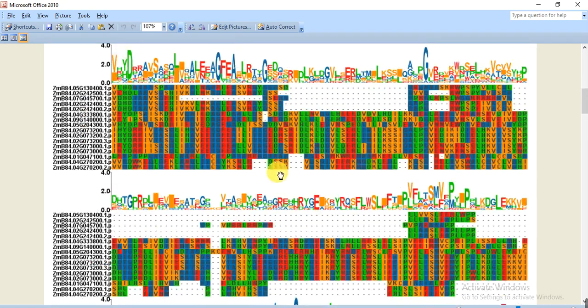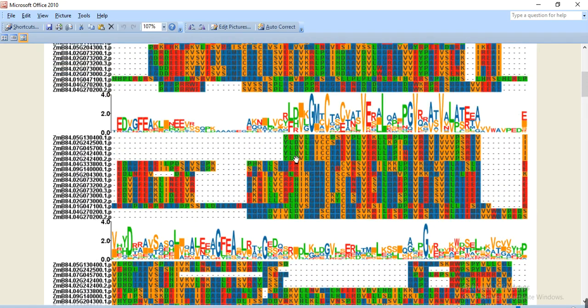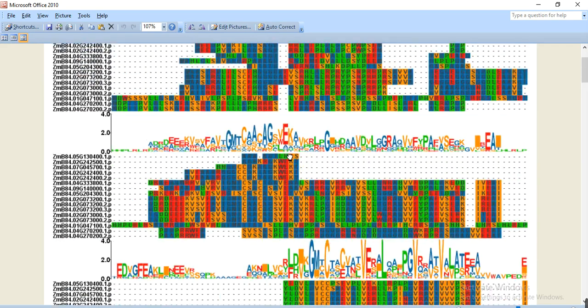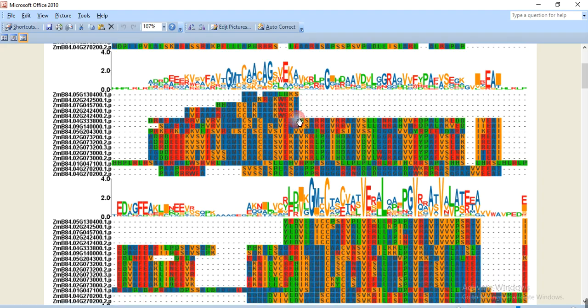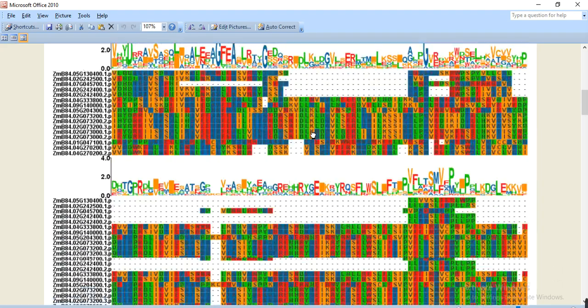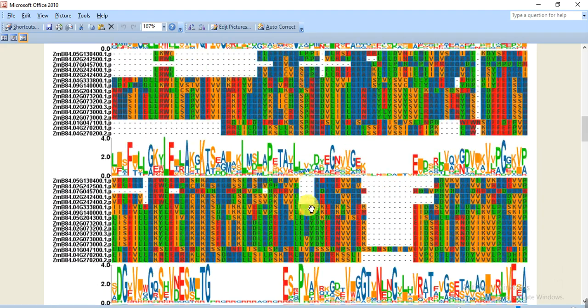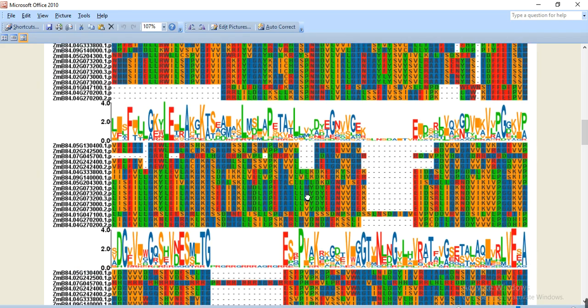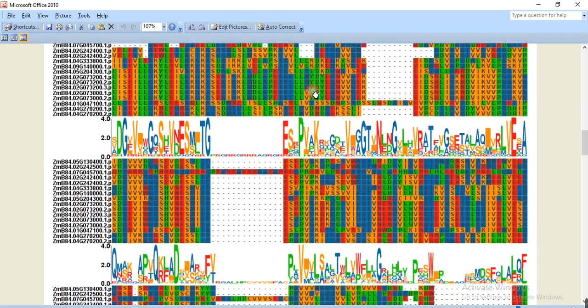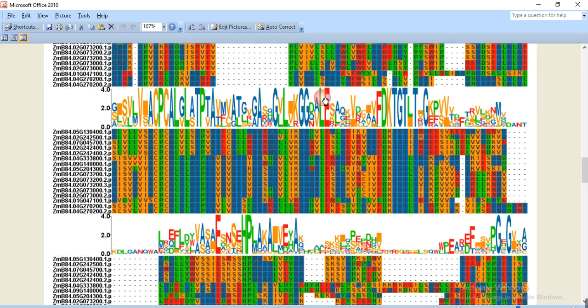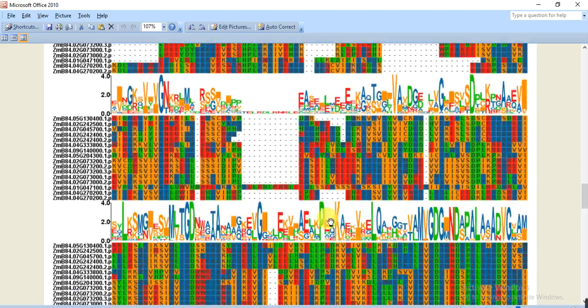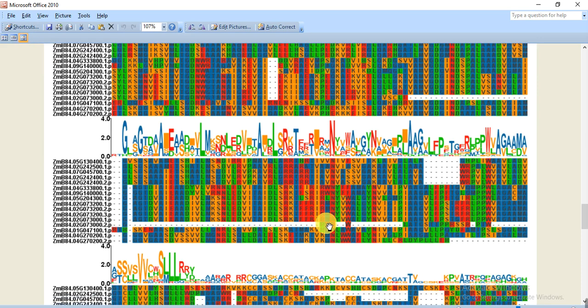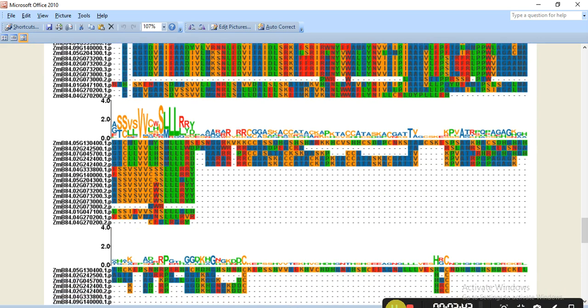So in this way you can make this alignment in one click and you can use this alignment in your manuscript or your thesis. This is all about how we can align our protein sequences in one click and make a beautiful colorful graph. Hopefully it will help you. If you have any questions please comment. Don't forget to share and like. Thank you.